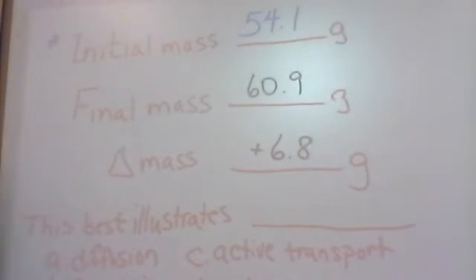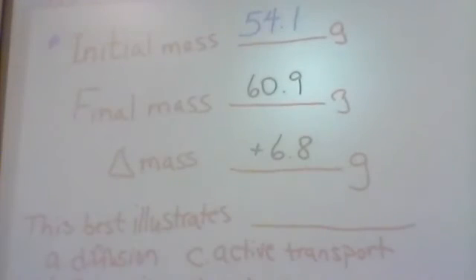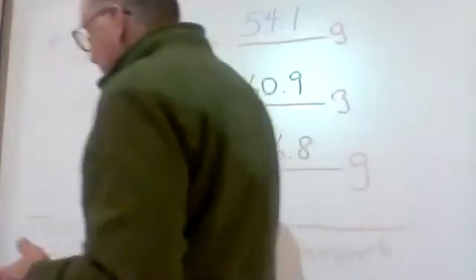Or maybe I just cooked the data. And then I put it over there, it's going to leap onto my table now. Careful with your stuff there, miss. We just don't get it in. I think that's just water, but.